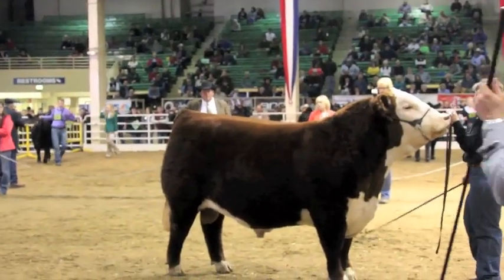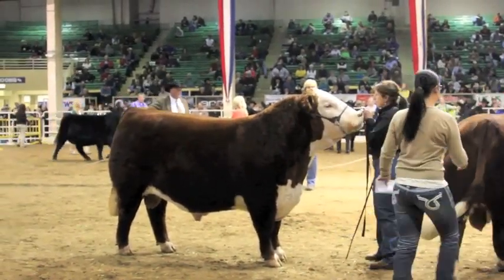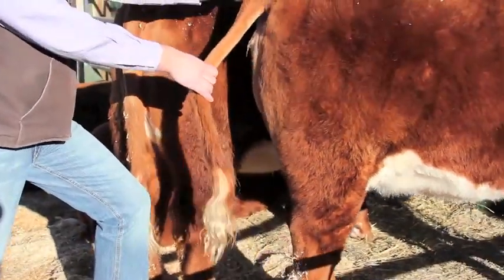AHA has come a long way in genetic achievement, from whole herd TPR to genomic EPDs. Today we talk with Geneseek's Zach Hall as he explains the proper way to pull a hair sample to ensure high quality test results.